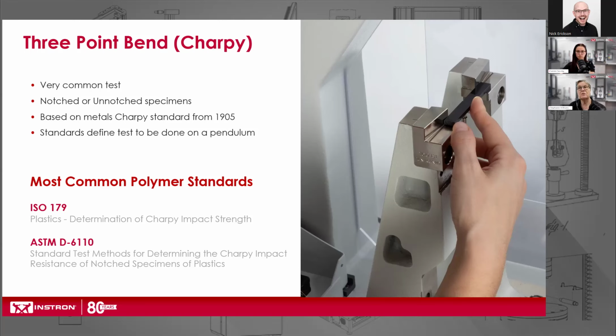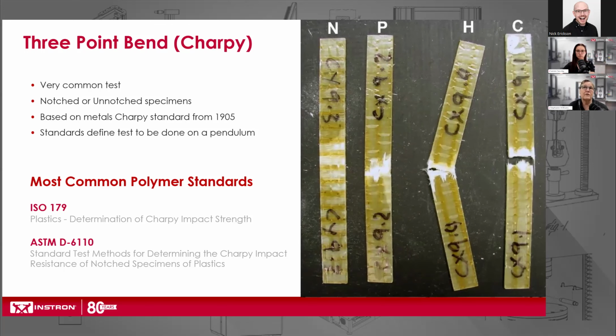In addition to the energy absorbed, you'll also need to make note of the break type. These break types are defined as a non-break, a partial break, a hinge break, or a complete break.